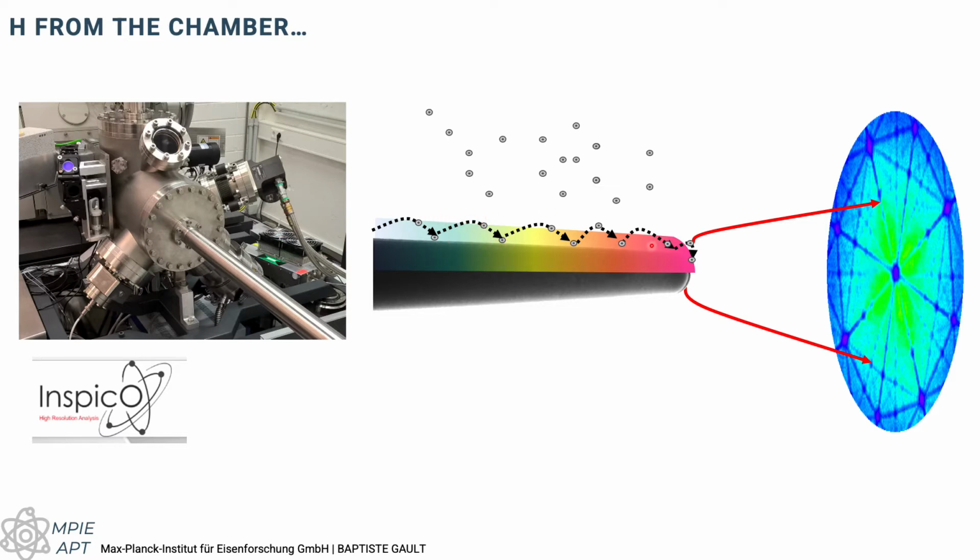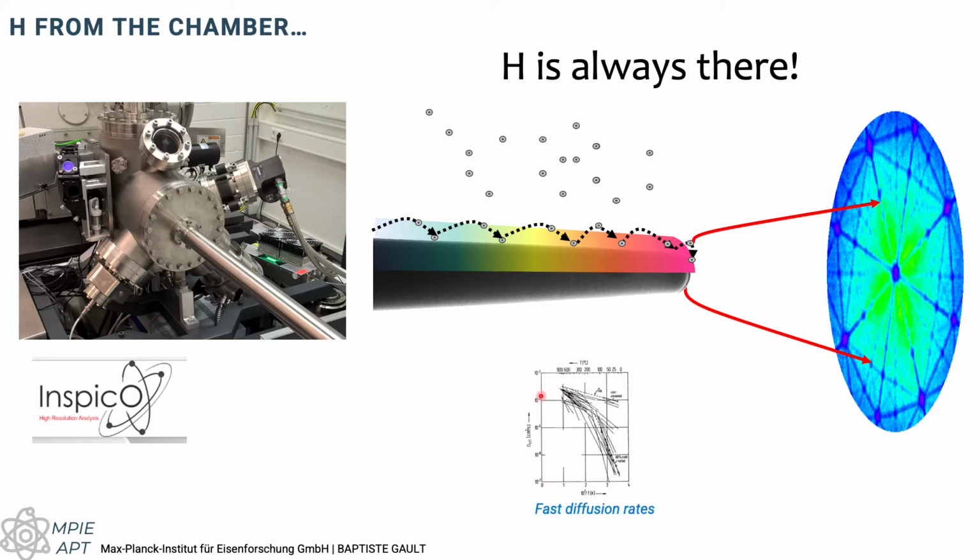It can just hop progressively because of the field gradients between the end of the needle and the edges, go towards the ends, get ionized, and get detected. Also, the hydrogen of interest, as I've highlighted before, can be extremely fast diffusing. So even if we manage to put hydrogen in, to detect it, we might have to cool down the specimen and then do cryo-vacuum transfer.